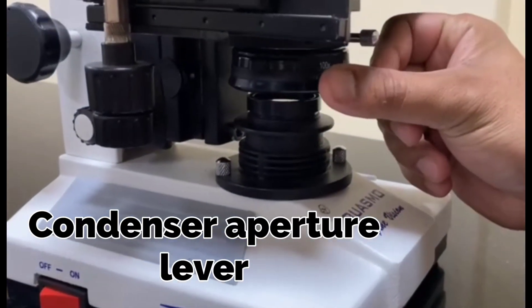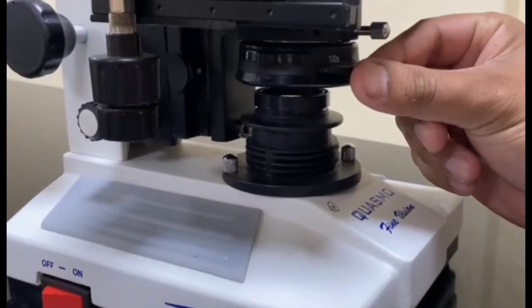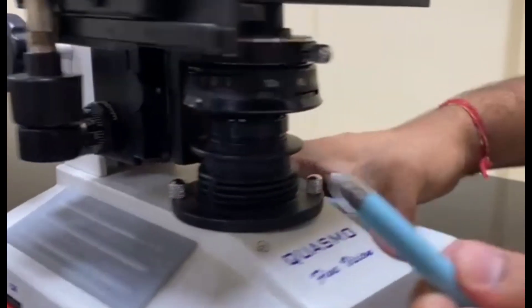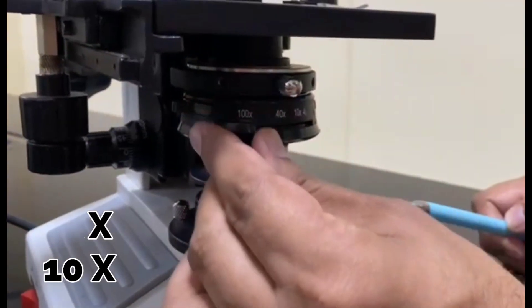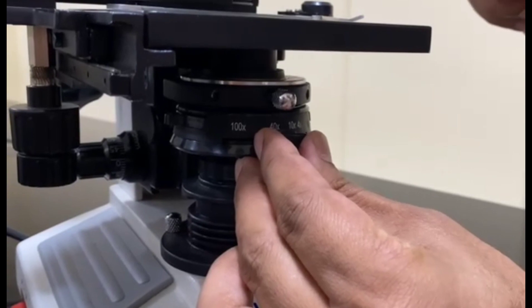Here you can see this is the condenser aperture lever that can be used to regulate the intensity of light. And here you can see that the 100x, 40x, and 10x is mentioned, you can set it accordingly.